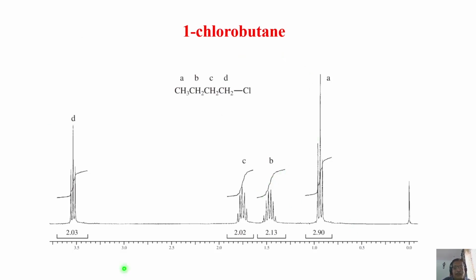Okay, when the molecule structure is known and the spectrum is known, you can interpret. But you must be in a position to analyze and interpret the spectrum of an unknown synthesized molecule. So we have to know how to interpret the spectrum and get the structure. So we'll get into more and more analysis, a couple more spectra, in the next one or two classes.